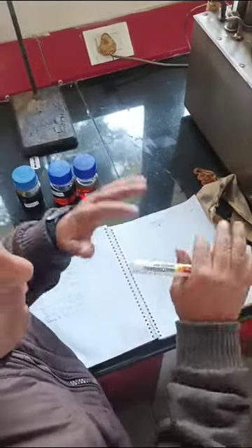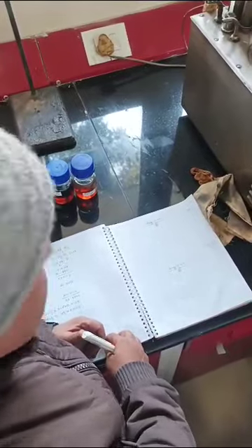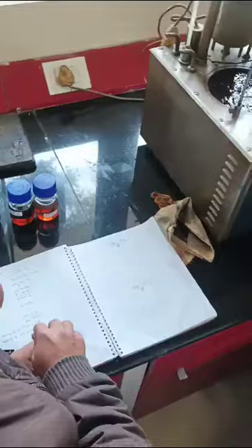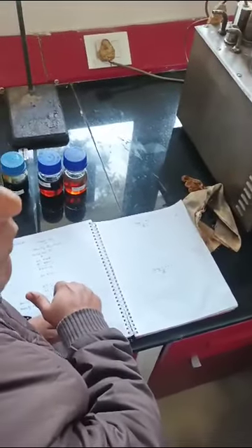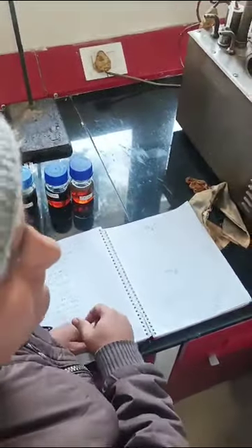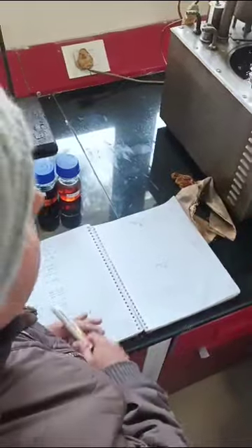Now you can convert the density to 15 degrees using the density conversion book we have. From there you can convert to 15 degrees centigrade, and we will report the density at 15 degrees centigrade. Why are we reporting the density at 15 degrees centigrade? Exactly, I already talked to you.